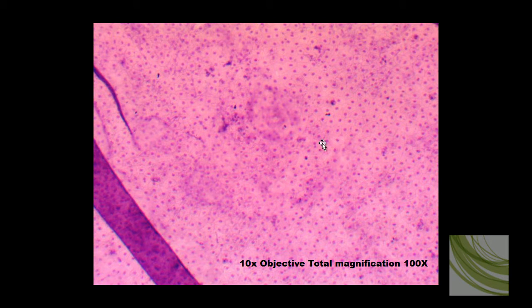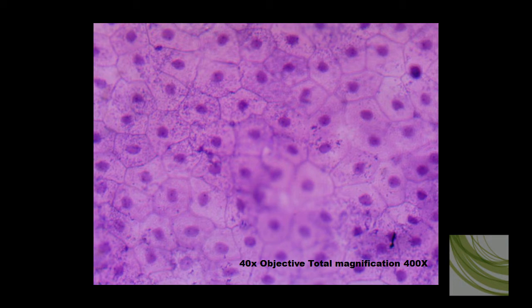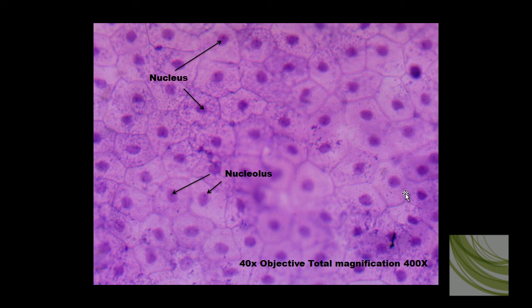Notice simple squamous always has an irregular shape — it's neither square nor columnar, it is completely irregularly shaped. We can see some nuclei in here. By the time we get to the 40x objective for a total magnification of 400 times, we can actually see the irregular borders of the simple squamous epithelium. We can see the nuclei, and the little dark dot is the nucleolus. So we can see a lot of different little nuclei in here.